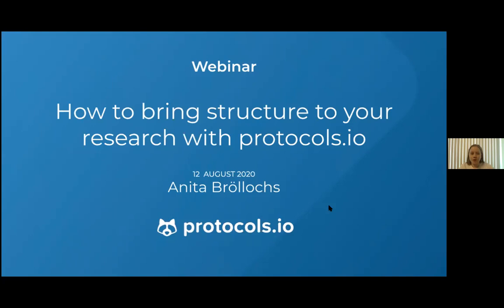And today's webinar will be on how to bring structure to your research with protocols.io.